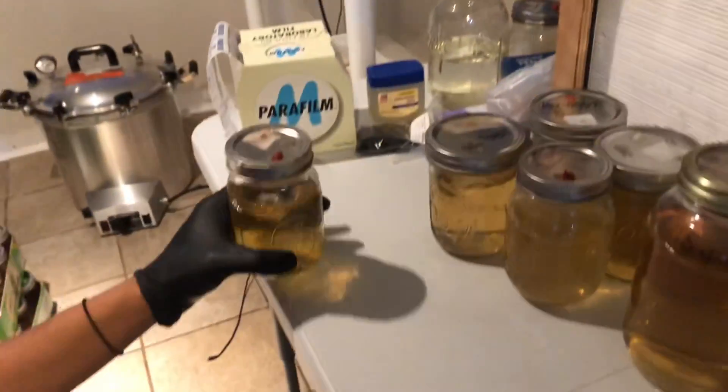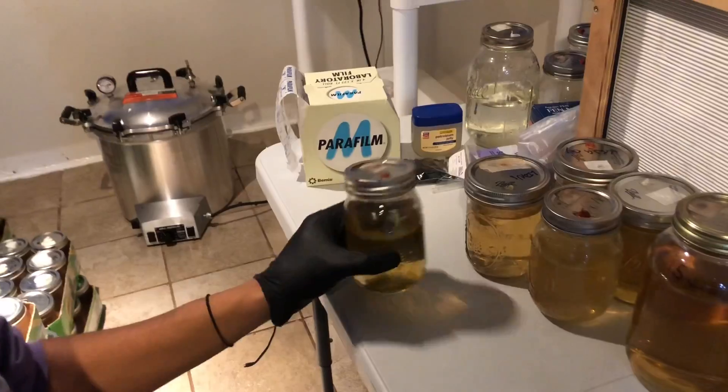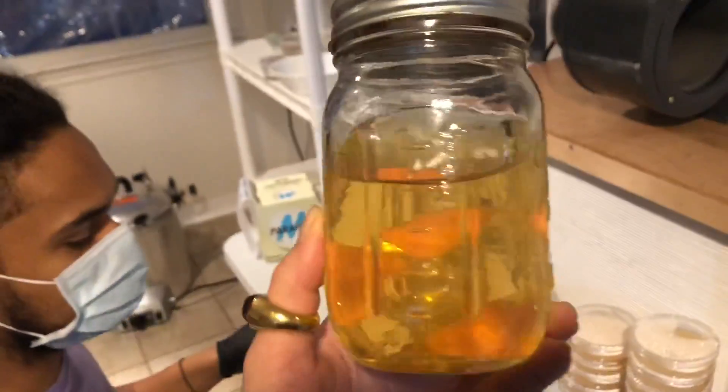Now that these are in here, I'm going to switch them around every day. I'm going to keep that in a nice cool dark place and switch it around every day until I start to see some mycelium growing in there.